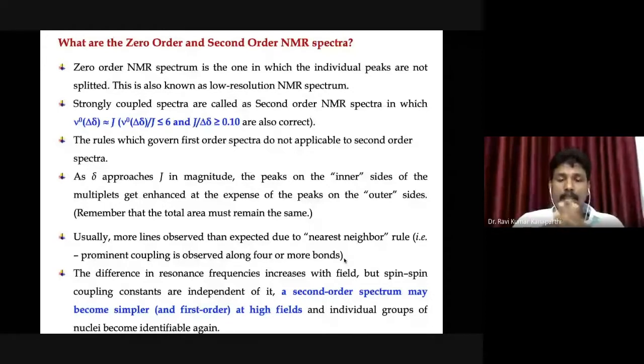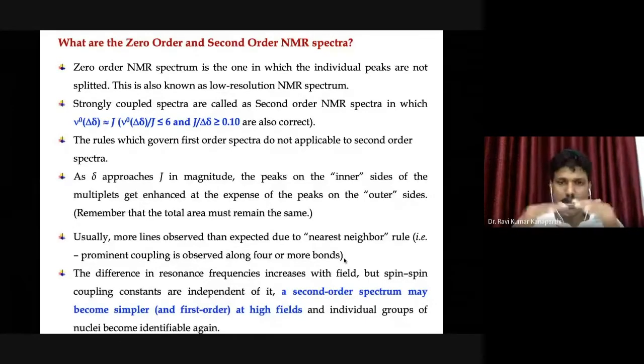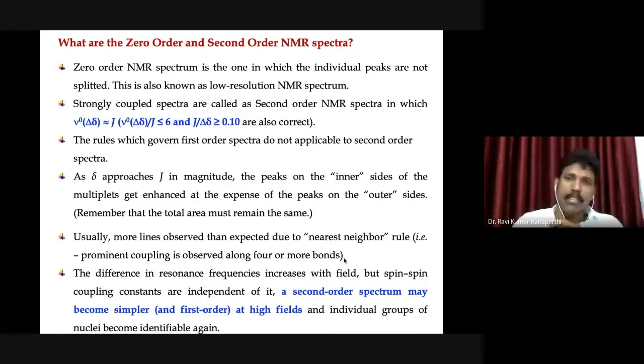There are certain elements, rare earth elements or alloys of rare earth elements, that when you subject them to a low temperature, typically around 4 Kelvin, exhibit superconducting magnetism. When you lower the temperature, they exhibit this magnetism. That is how the magnet works in the modern NMR instrument.